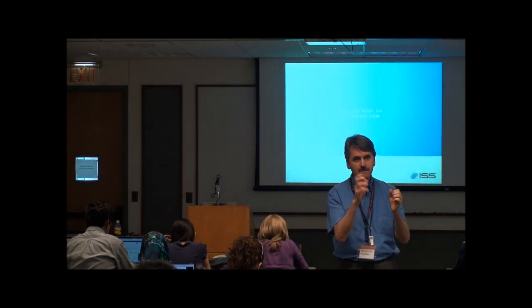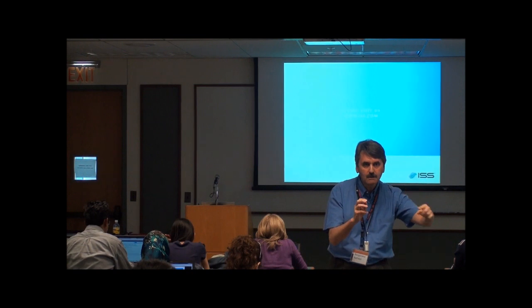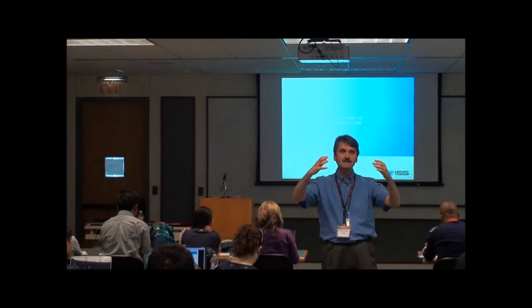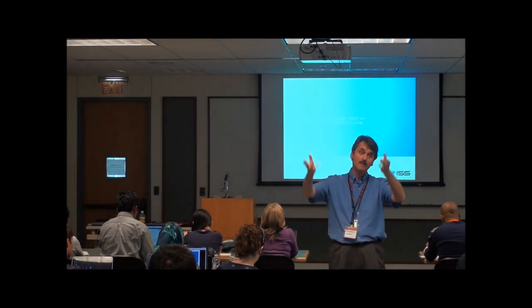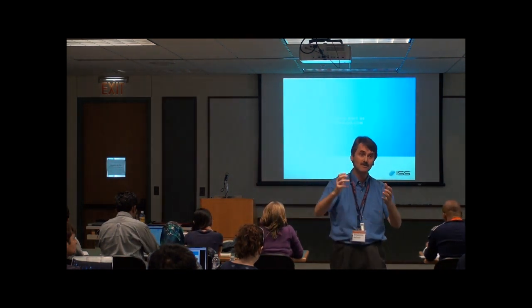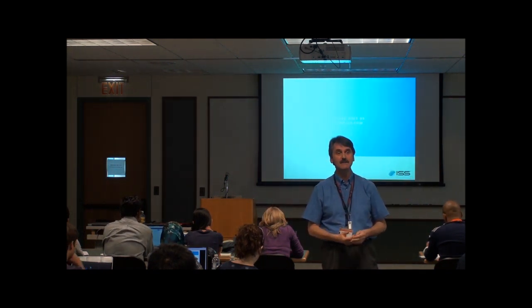So you keep sending photons onto the system, and you record all the photons that are emitted. It's a statistical process because you have billions of trillions of molecules being excited, but at the same time billions of trillions of molecules that emit photons, and so you always acquire photons in a steady state experiment.